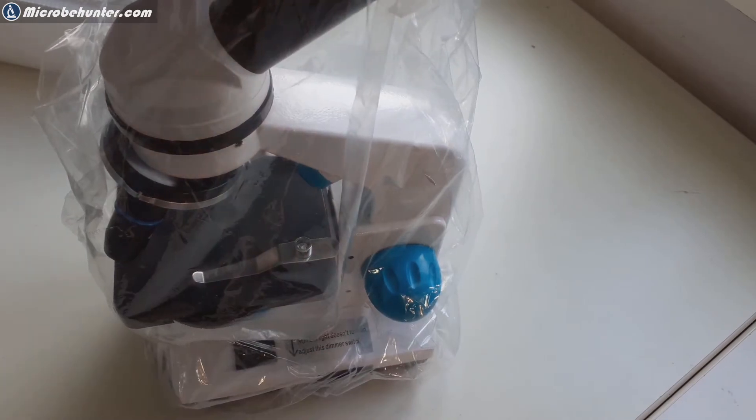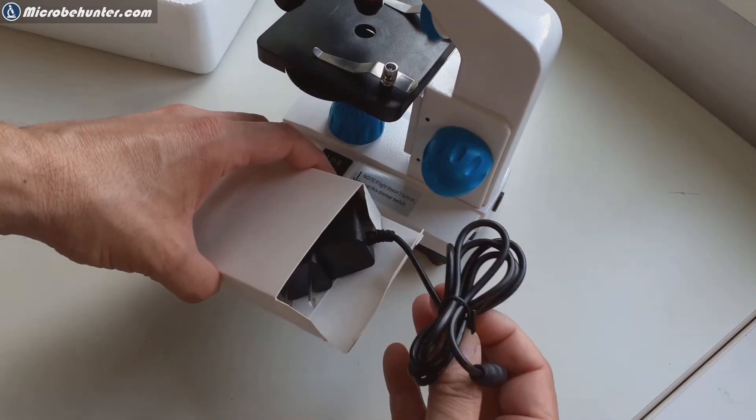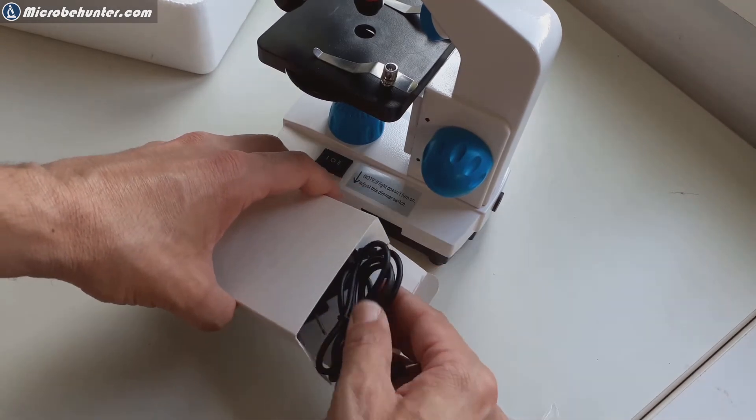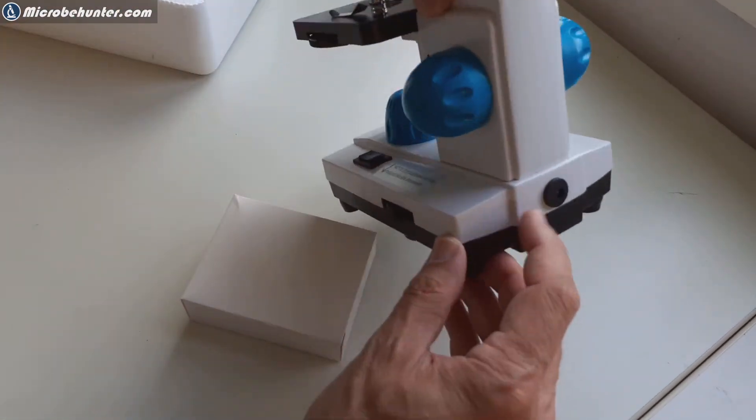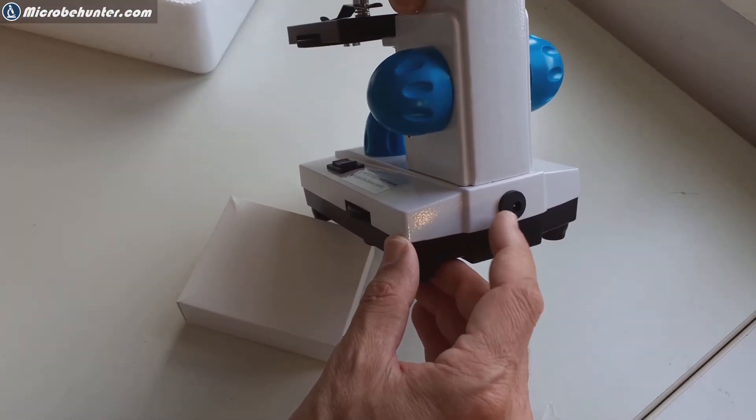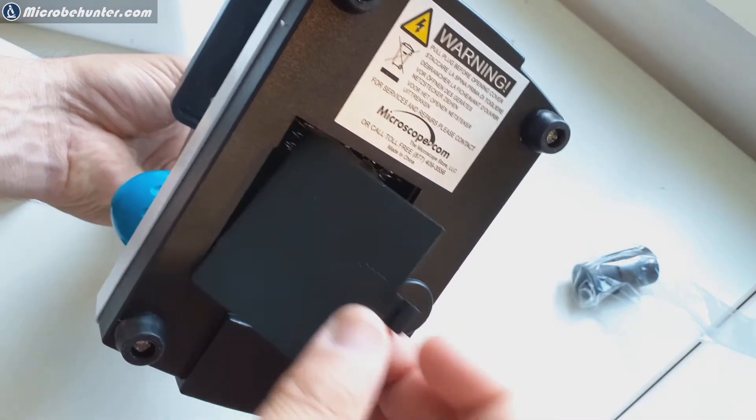Actually really it's the first time unpacking it here and so that is the power adapter okay so of course you don't have to use it you can use it also with non rechargeable batteries as well but it plugs in here on the back and if you don't have any batteries of course then you will use the power adapter.